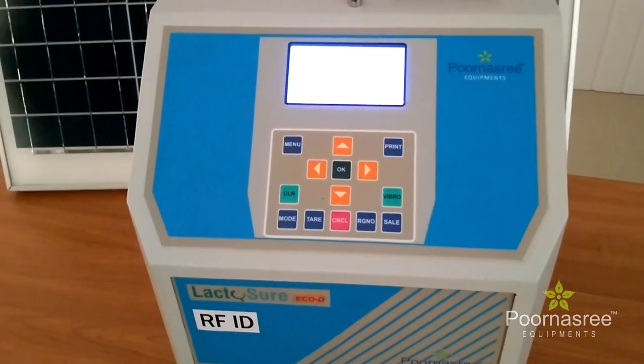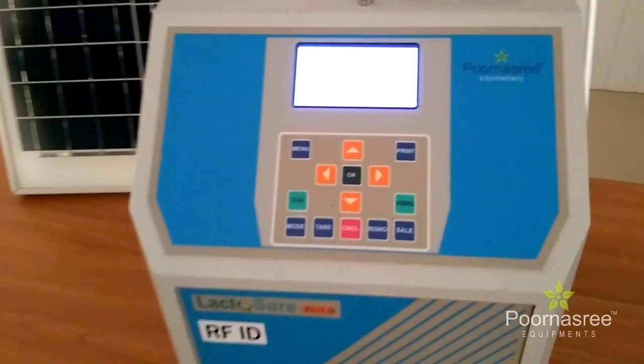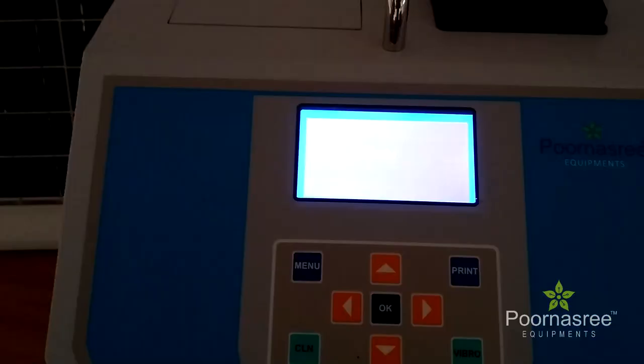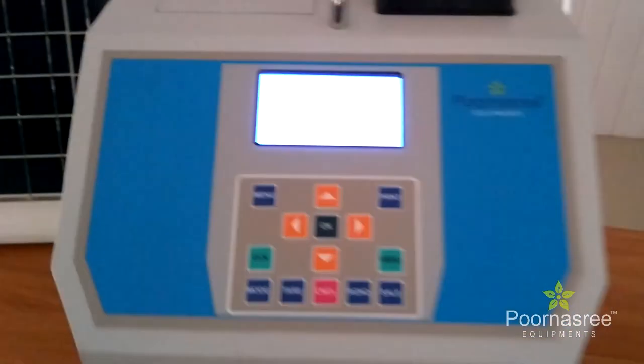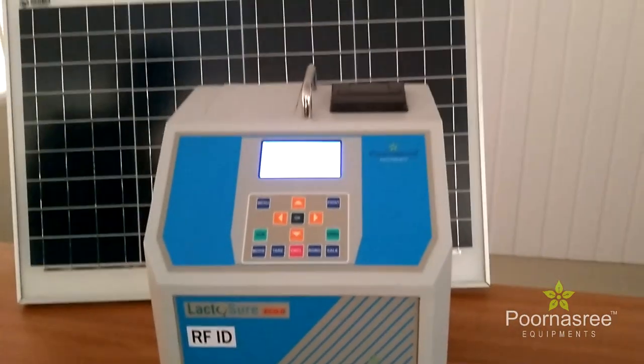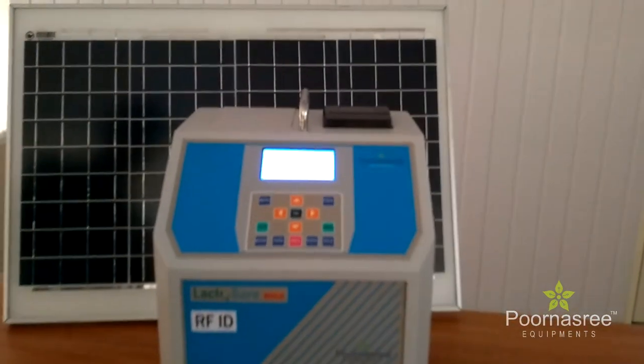This equipment has these additional facilities, and due to the availability of solar panels and the inside battery, every user can use this equipment even at the time of power failure and in power-deficient areas where electricity is not available.